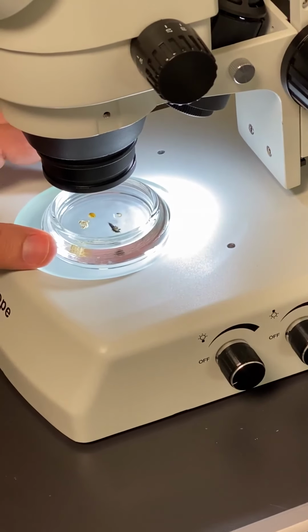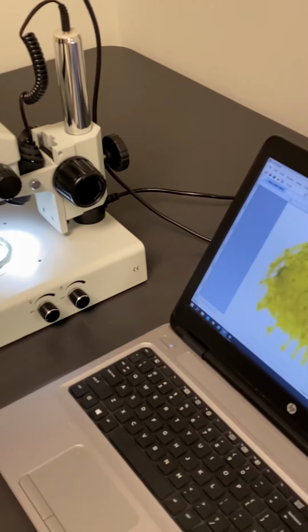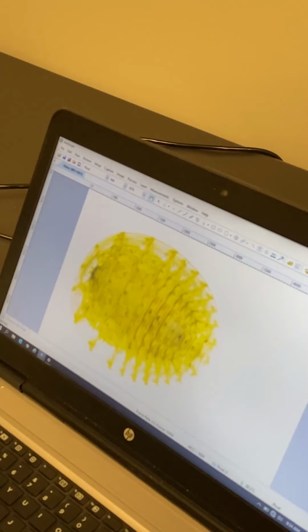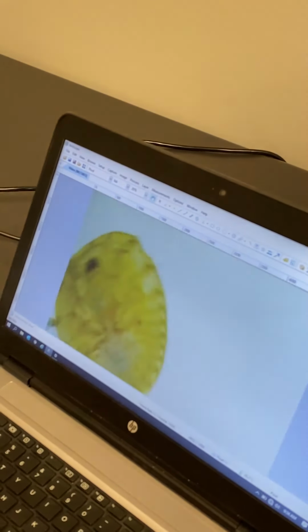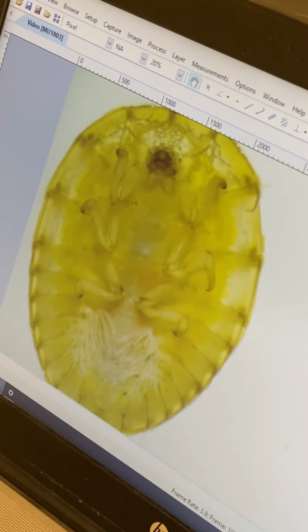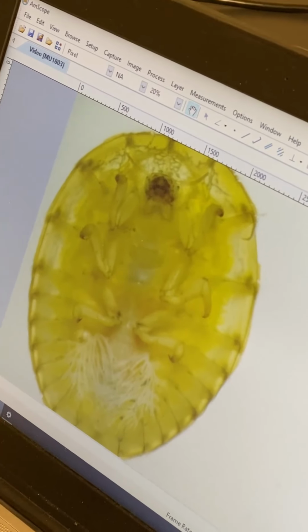Here, let's move this. See if we can get something else up here. This is always a fan favorite here. This guy is a type of beetle, Psephenidae. Normally, the common name is the water penny. These guys, they're clingers. They get flat on the rocks and stuff. They're pretty cool little guys. They're real thin. Let's see if we can flip him over and look at his underside. There you go. And you can see his head, his legs, and he's got gills down here. So that's what he looks like underneath. Almost turtle-like or horseshoe crab looking.